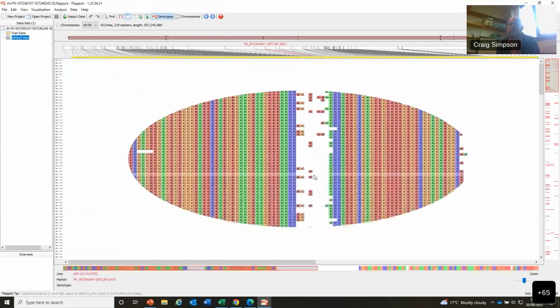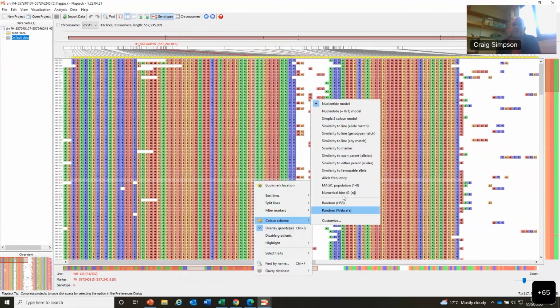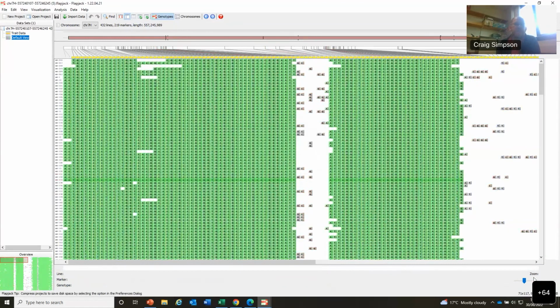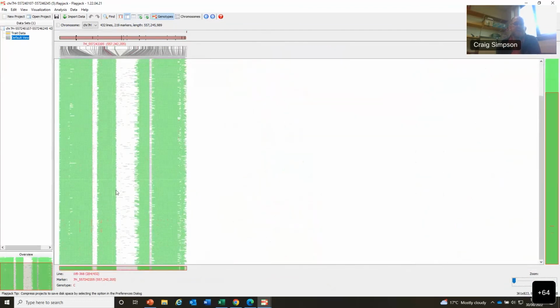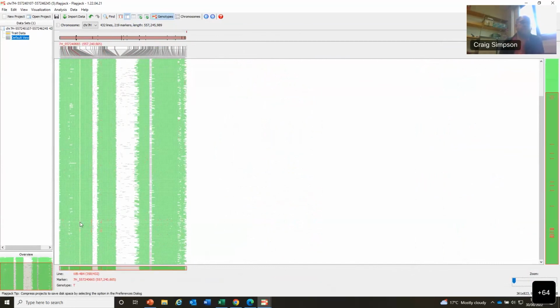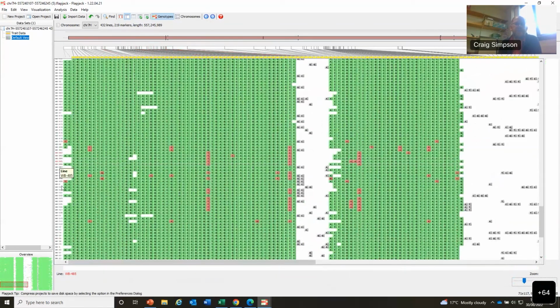So this is a bigger data set. And again, I'll change that. Okay. If I come back here, you see that this is much more, there's very few cases, but down in here there's a group of, so I click on it here. So you can then pick out these different SNP variants within this part of the population.